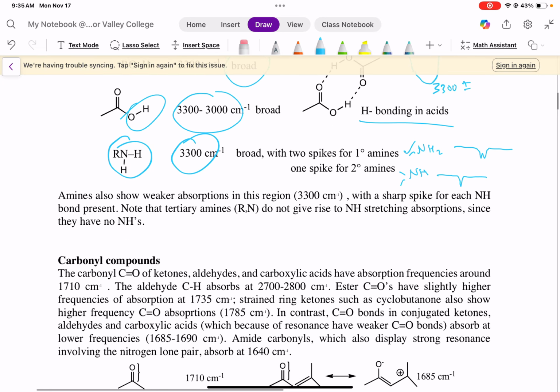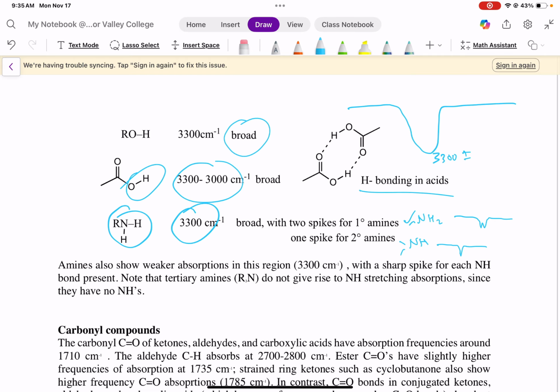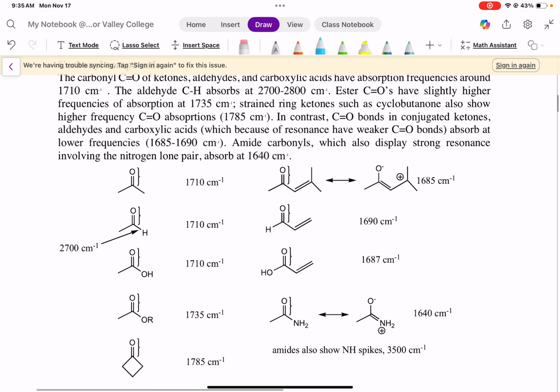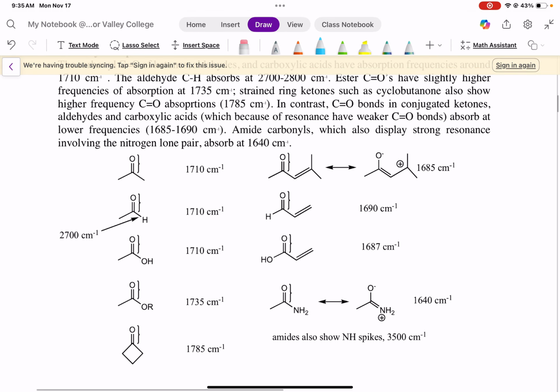It helps us to identify the special signal for functional group. So when you run the IR, you pretty much can tell your compound is a ketone, aldehyde, or carboxylic acid. They're all in the same range, or even ester, right? Or alkene. If you have good experience, and you have a ketone and a double bond alkene, then it dropped down to just below 1700, right?